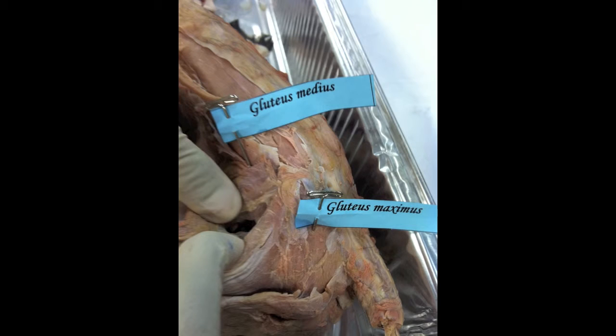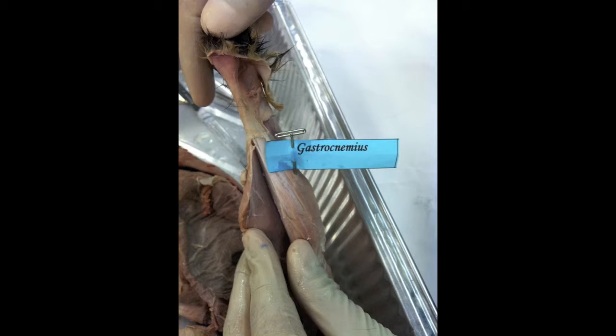The function of the gluteus medius is the abduction of the hip and medial rotation of the thigh. The function of the gluteus maximus is external rotation and extension of the hip joint, and it supports the extended knee. The gastrocnemius flexes the foot and flexes the knee.